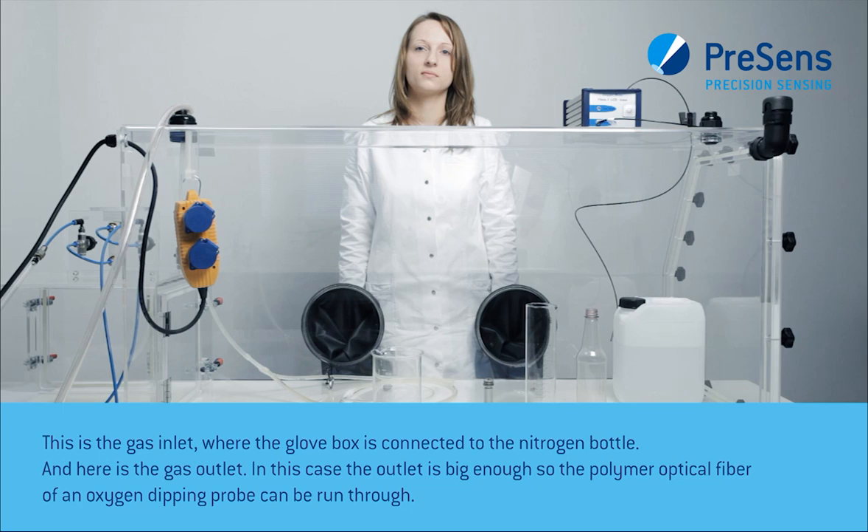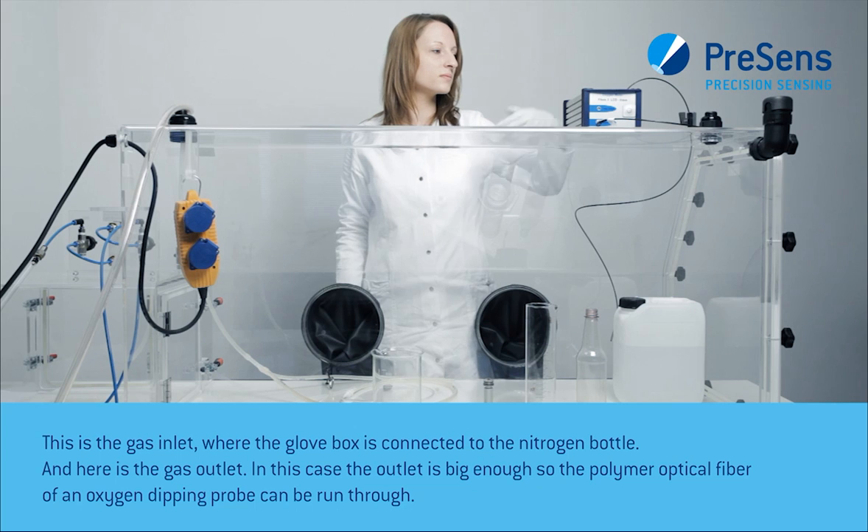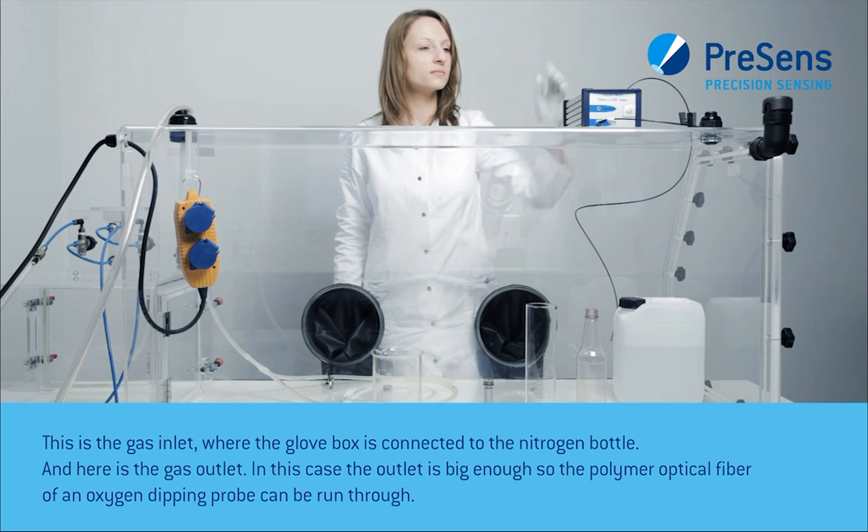This is the gas inlet where the glove box is connected to the nitrogen bottle. And here is the gas outlet. The outlet is large enough so the polymer optical fiber of an oxygen dipping probe can be run through.